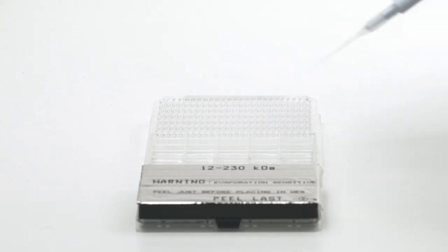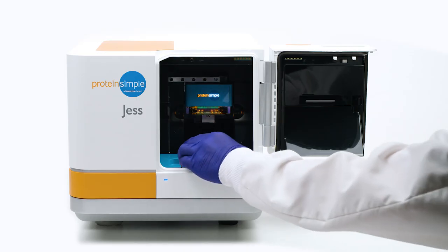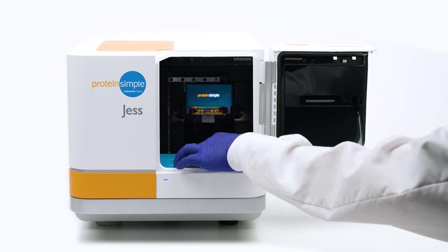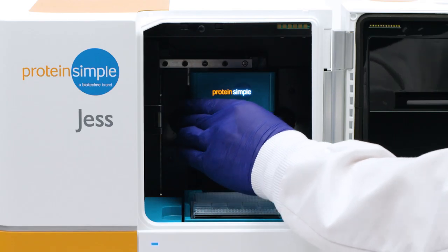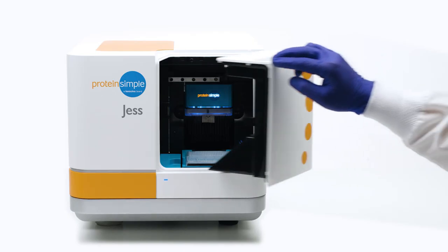Just load your samples and reagents into the microplate, insert the plate and capillary cartridge, and Jess does the rest.